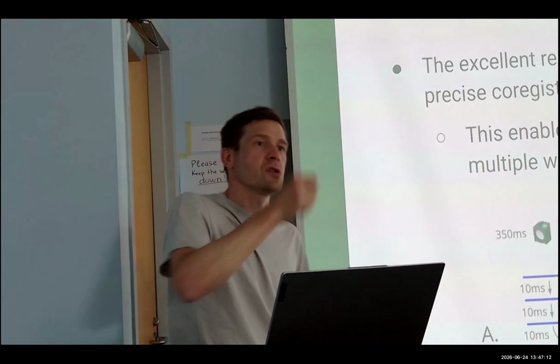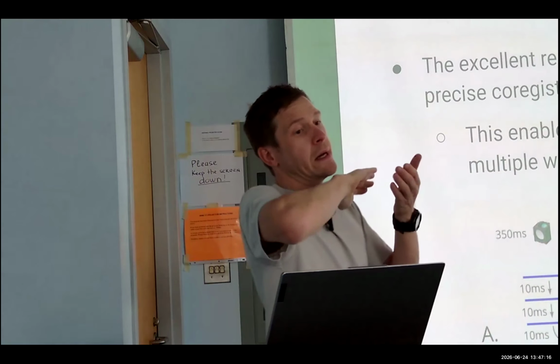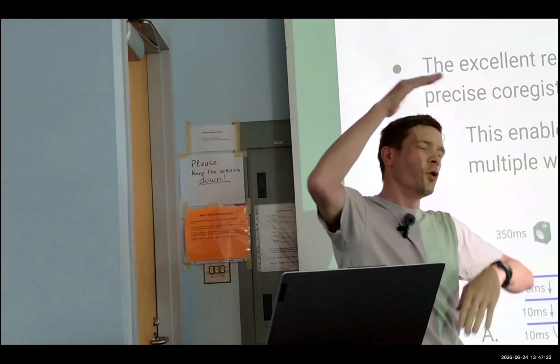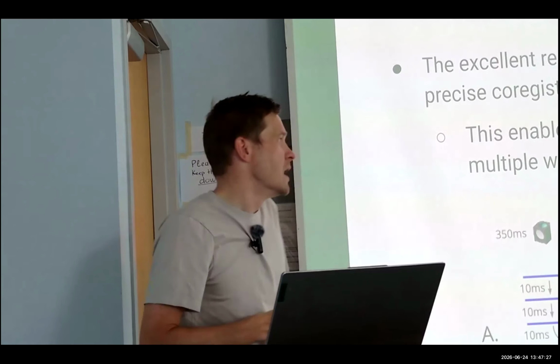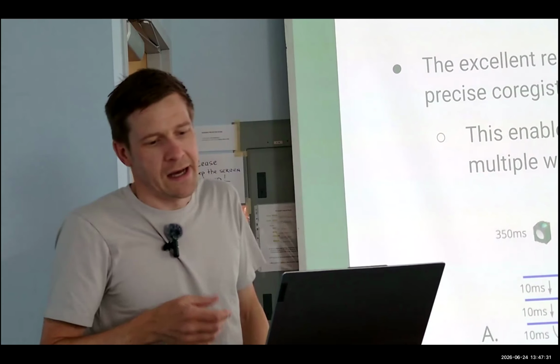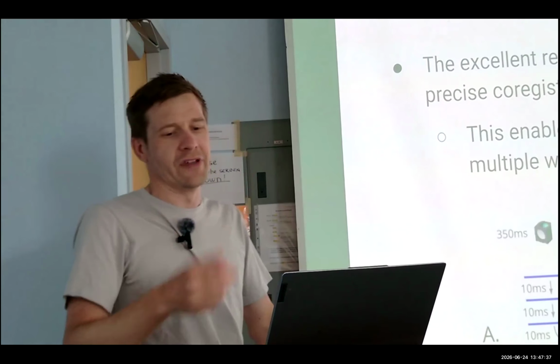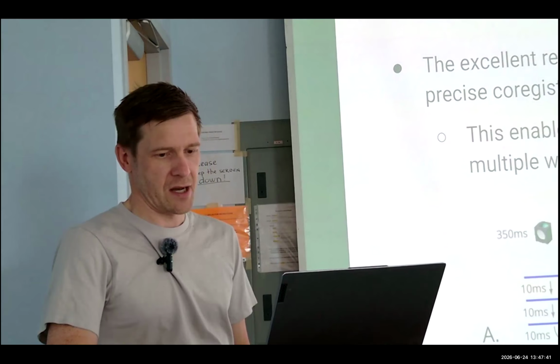As you start moving to the real world, where you're doing a large tiled acquisition across multiple focal planes with multiple wavelengths, you're talking thousands of images. This is literally the difference between running it while you go out to get lunch and sitting there waiting for it all day. So yeah, it really does add up.